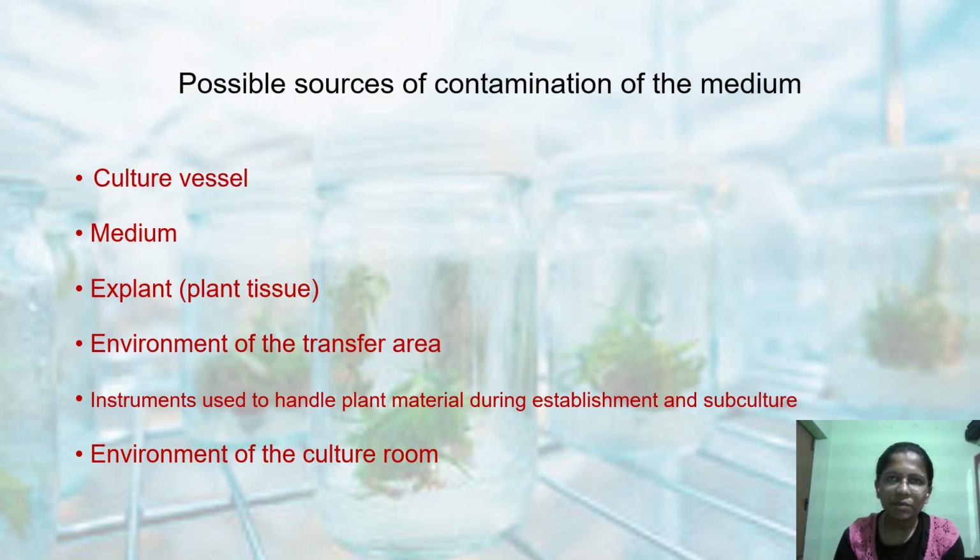And whatever equipment you have seen, forceps or glass vials or any other things, also leads to contamination. And after all these steps, finally we will be keeping the media as well as the media containing the explant in a culture room. So there also we can expect contamination.